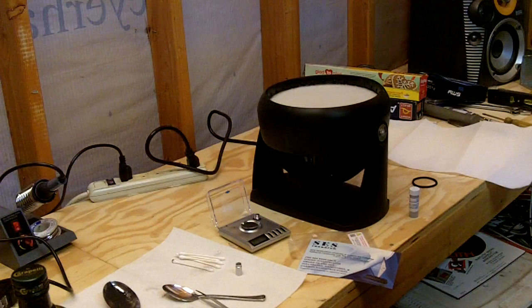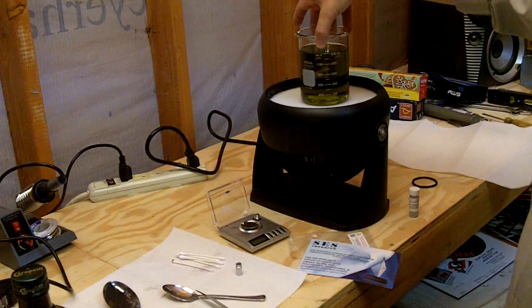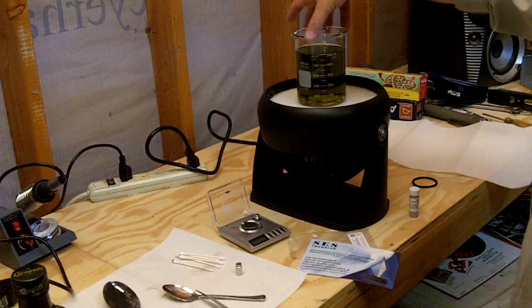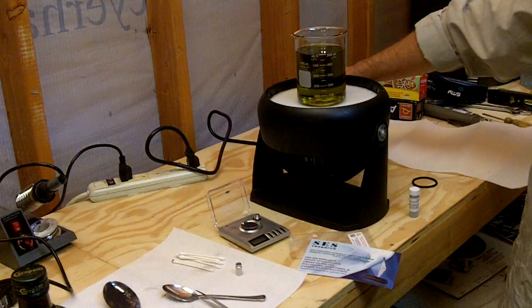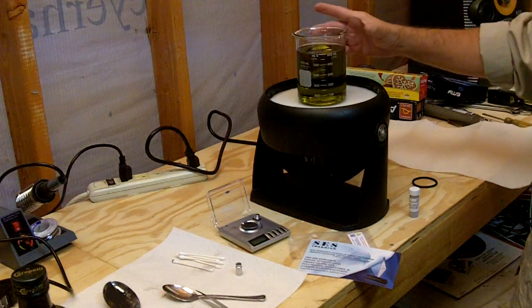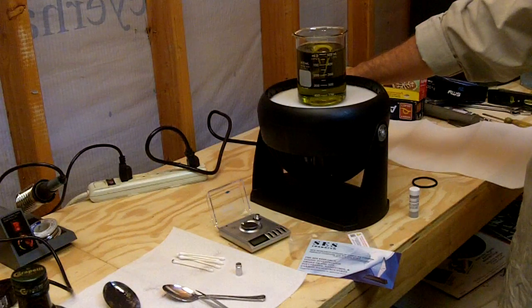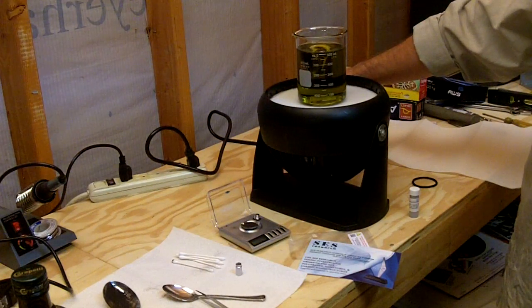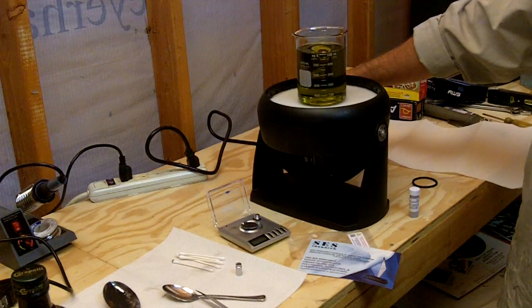At the bottom of the beaker is my magnetic stirring rod. I'm going to set that in the center here, turn it on, and it'll start spinning. There's a little vortex starting. You don't want too much air in there — you don't want to aerate the olive oil too much — you do want to get it kind of moving.